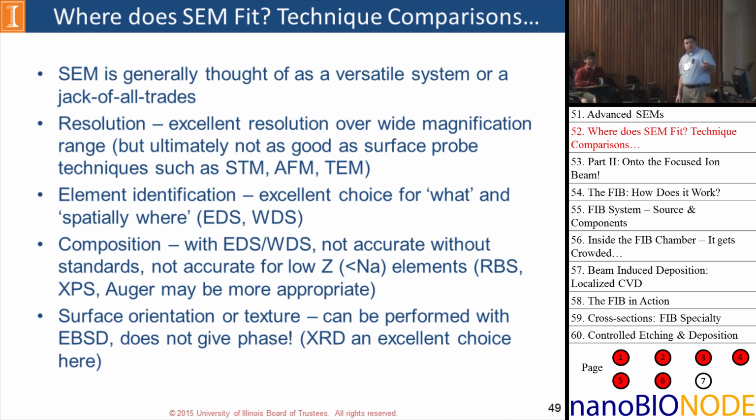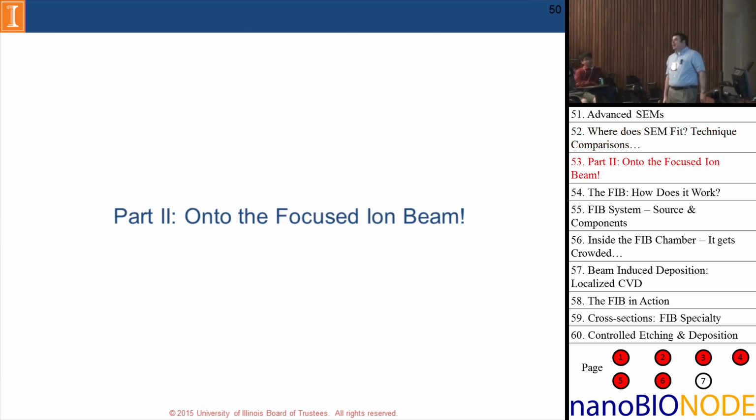Surface orientation or texture can be done with EBSD, but once again, does not give phase. Go talk to Mauro. Mauro wants to talk to you about XRD and have everyone use XRD and have that be the only thing that we ever use in the center. So, all right. Now the fun part, the focused ion beam, my favorite.